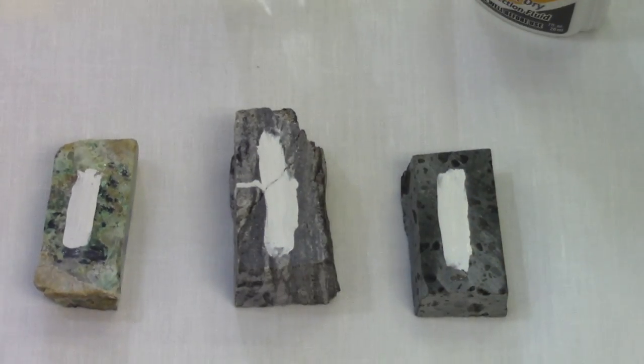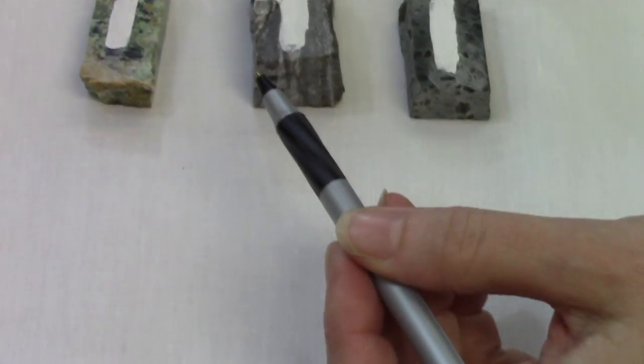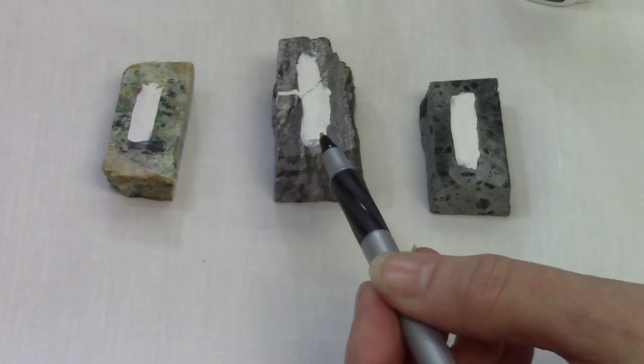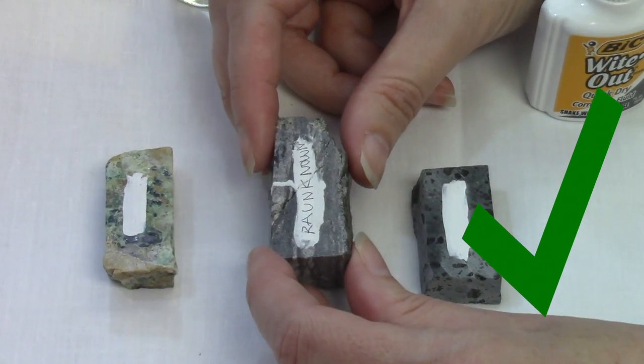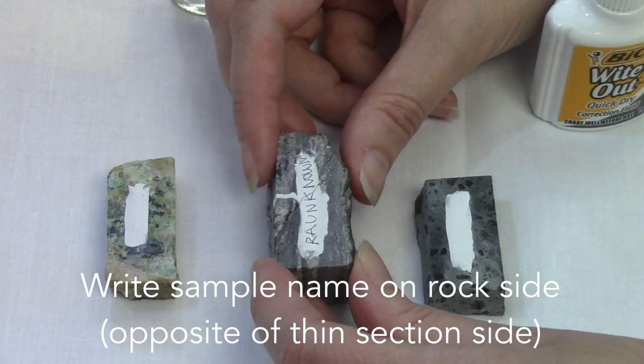Once they're dry, you can write the sample name or number on the rock. This is perfectly acceptable and you don't need to go any further than this.